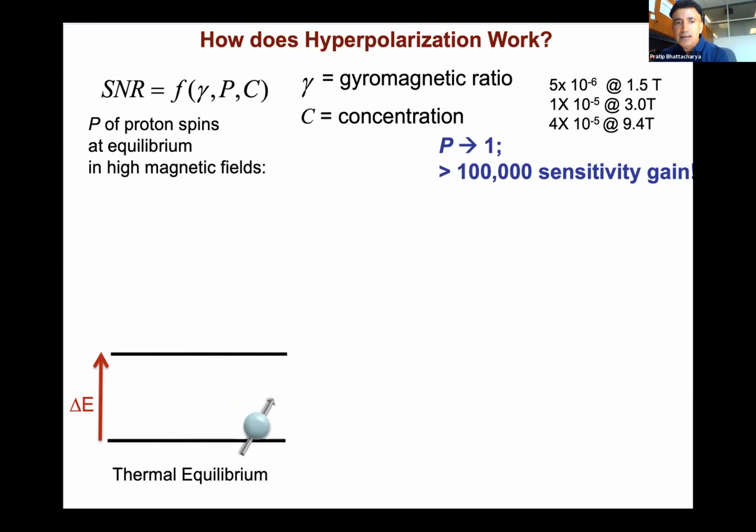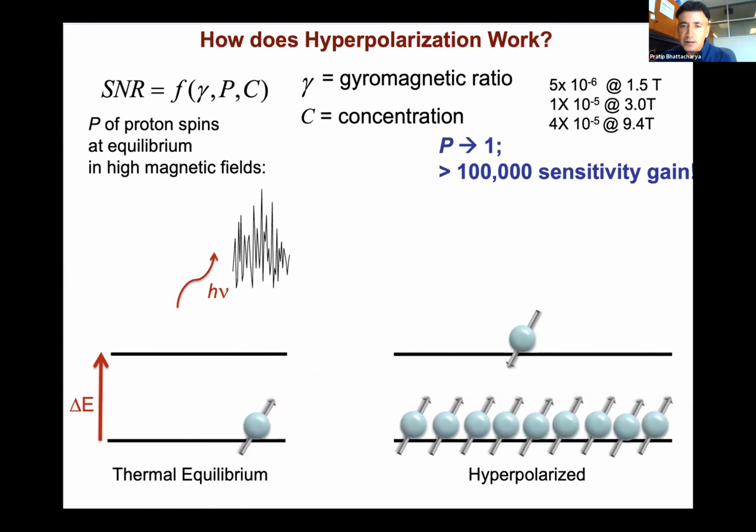We should be able to see a signal, which is fine, but in NMR spectroscopy, you can average the signal over a period of time and get a reproducible high signal. But in MRI, unfortunately, patient tolerance is a big problem, and you also cannot use techniques like spinning. You cannot spin a patient, that's not possible. So we get a very low signal.